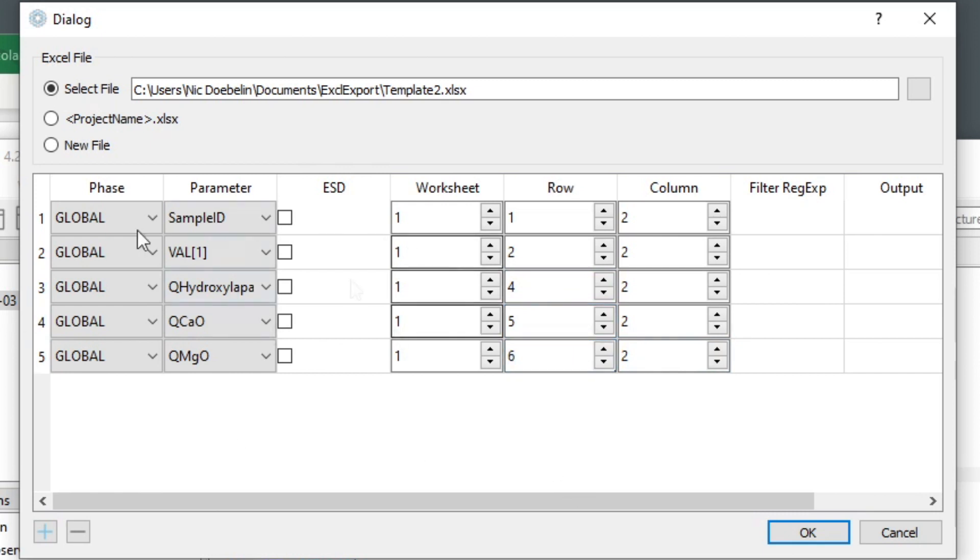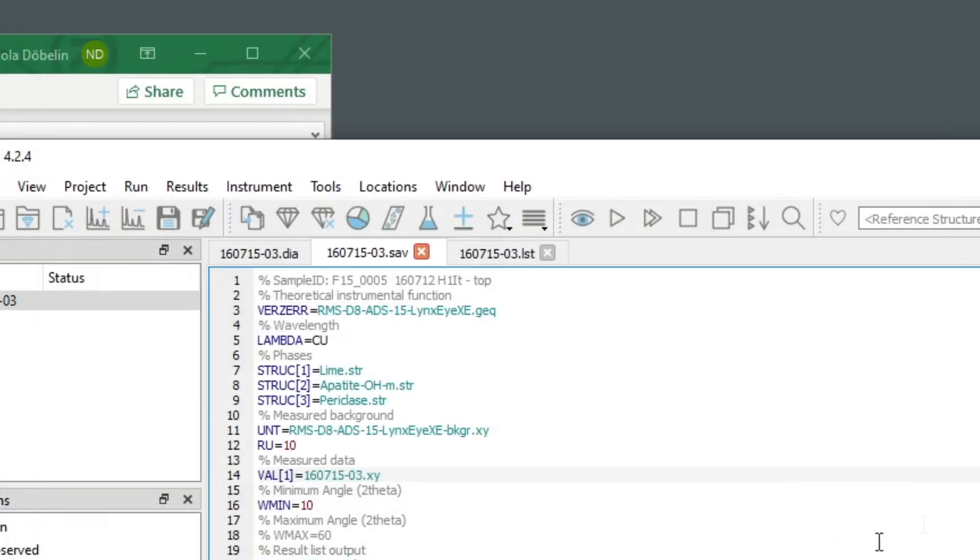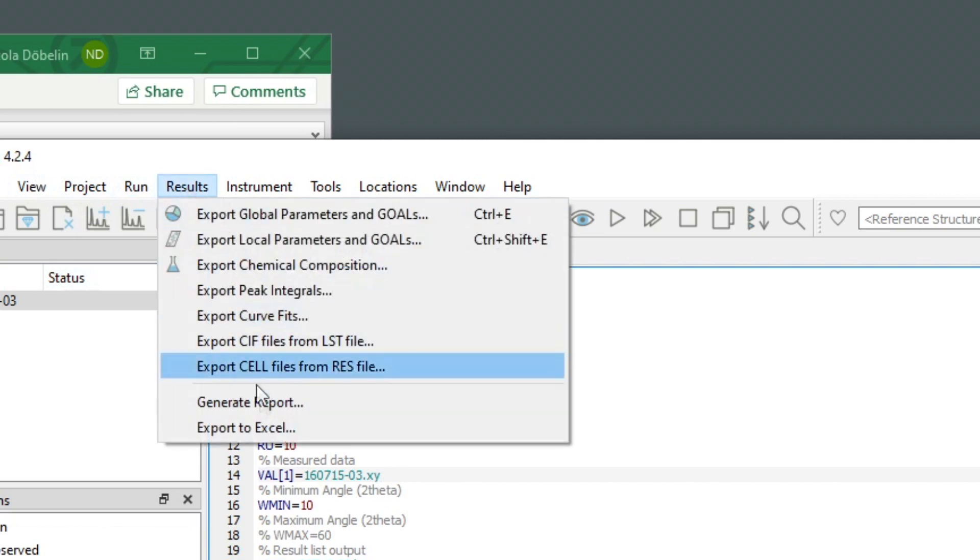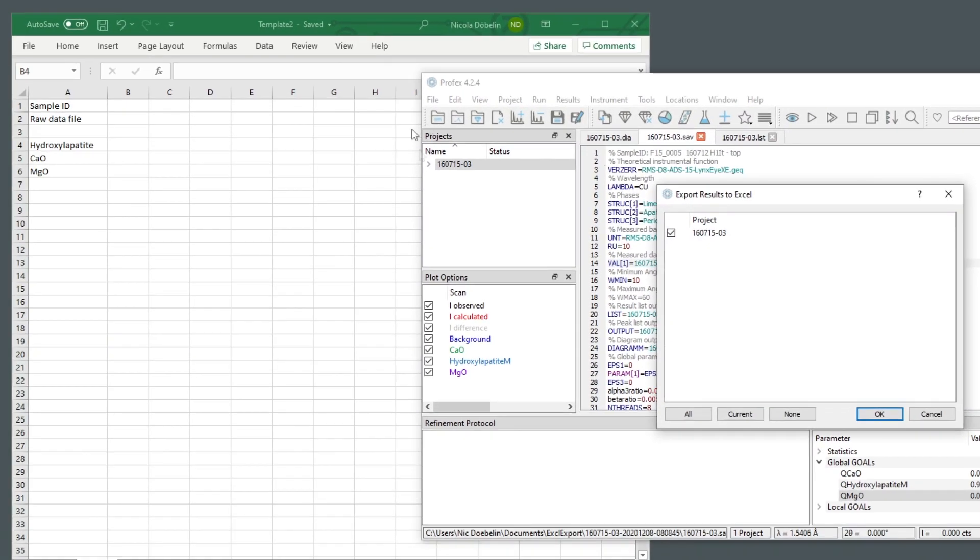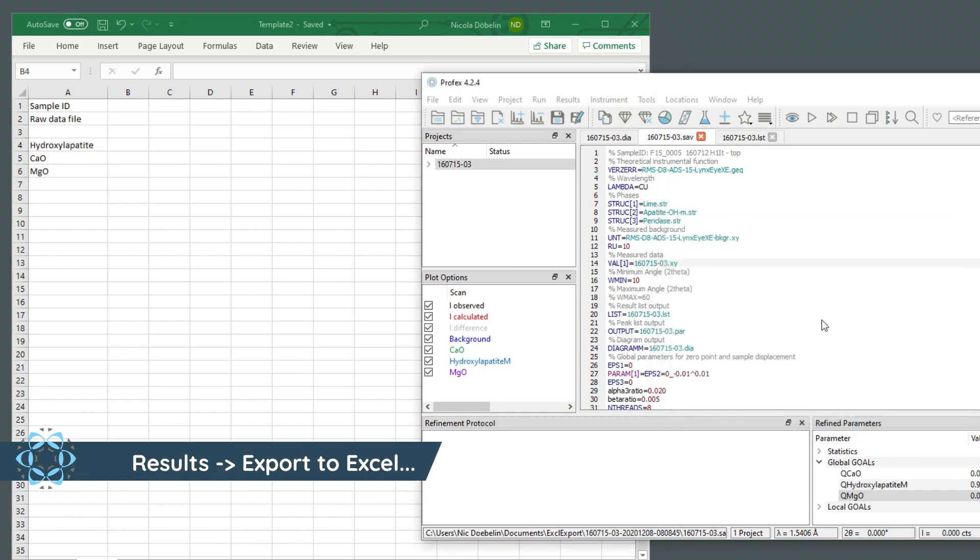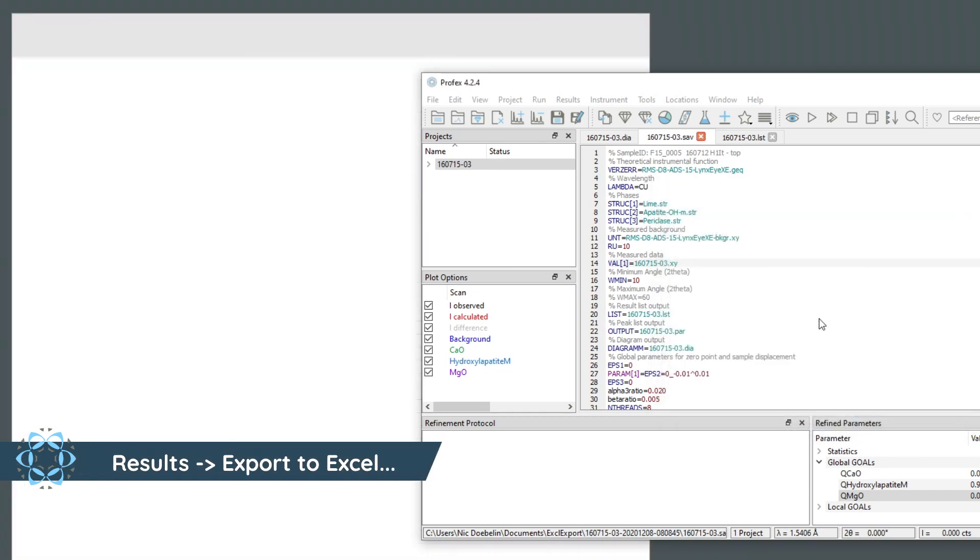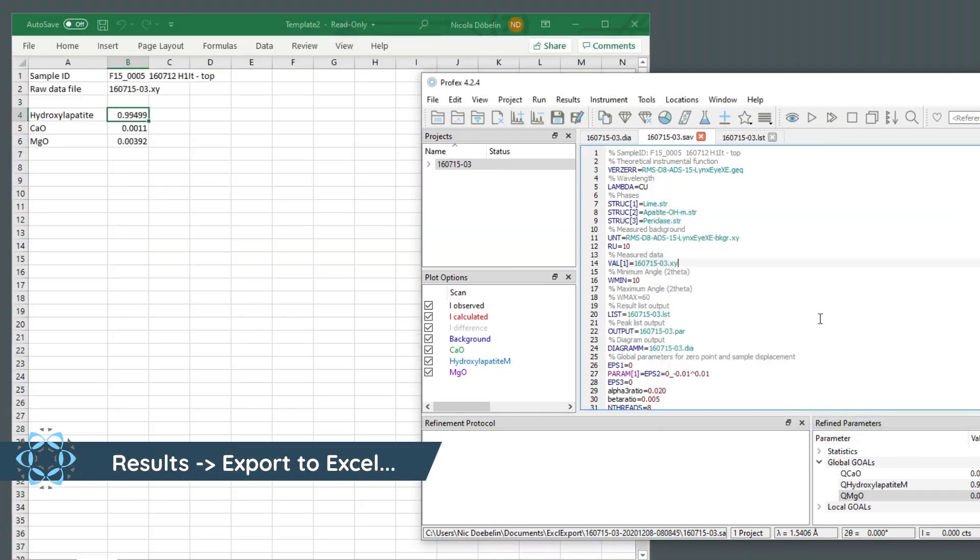So now we have set up our Excel export. We click OK. And to actually export the results, we go to results, export to Excel. We only have one project. So we select this one. And here we go. All the results are written to this new template.